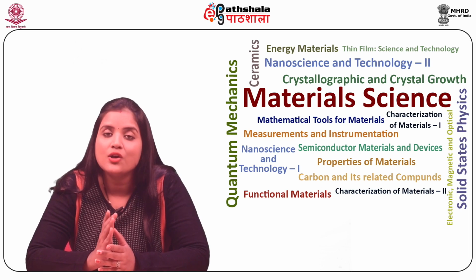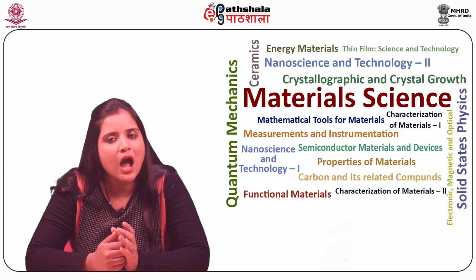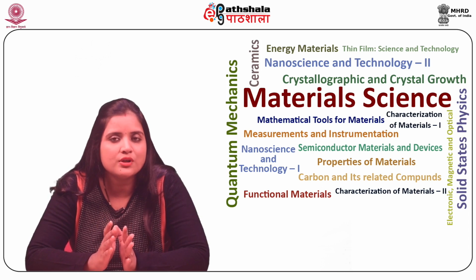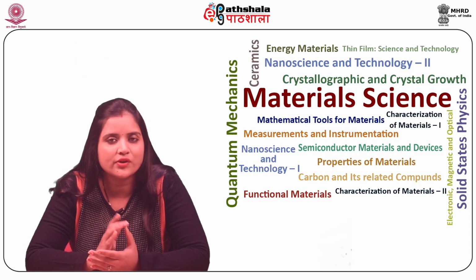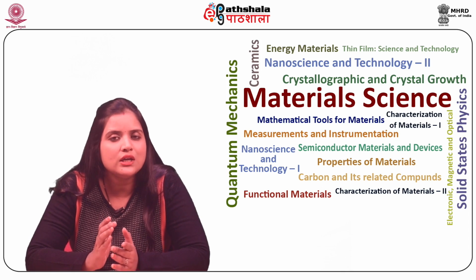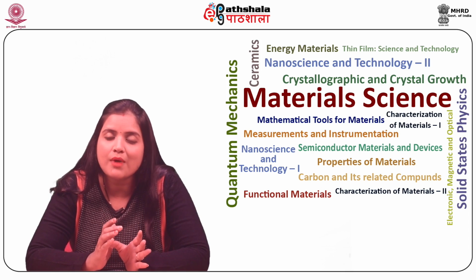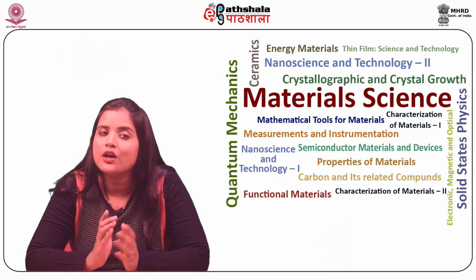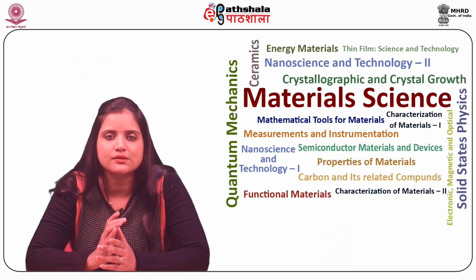These developments drew researchers away from expensive and highly technical film-based microscopes and opened holographic microscopy to a much wider audience. The advantages gained in cost, ease of implementation, and versatility are seen by most to outweigh the loss of resolution in moving from holographic film to digital pixels.